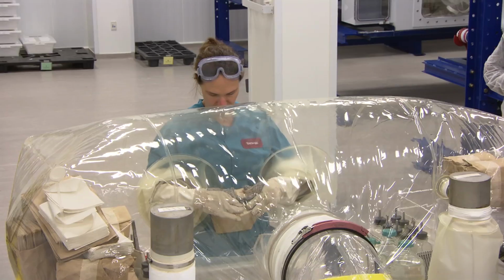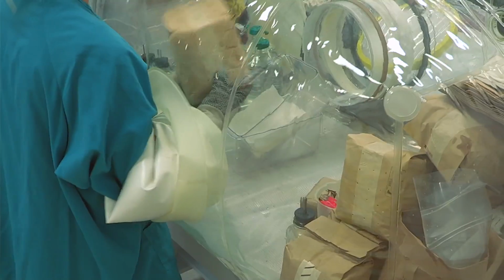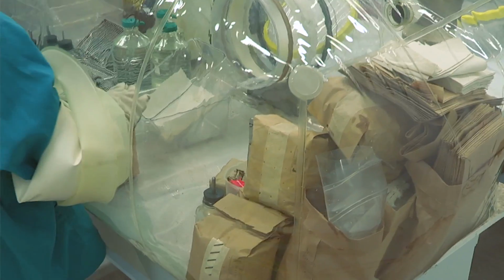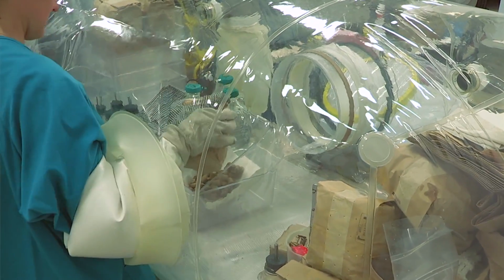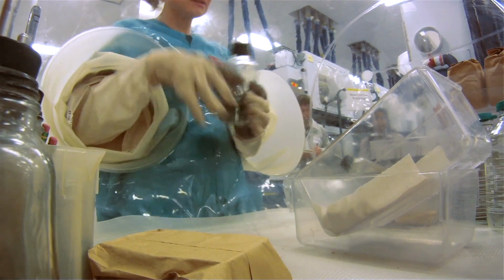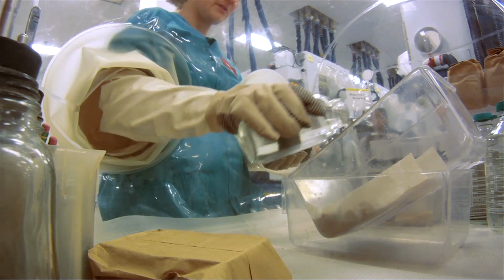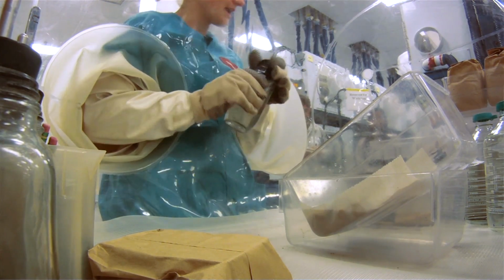And place some feed in here. Fill this up with some feed and water. Lots of water. The key is just some water. You always want to keep this feed moist.